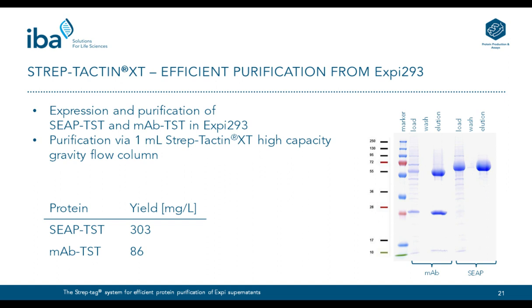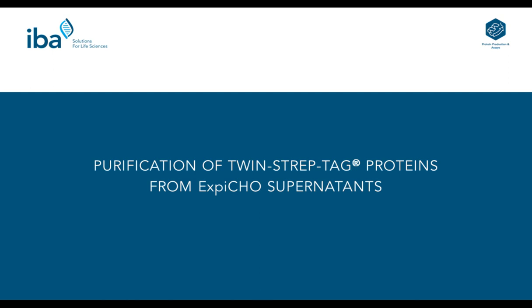And on the right side, you can see again that under these real conditions, we were able to achieve very high protein purity from the purification of the samples. So as you can imagine, we were quite happy with this result, and Thermo was too.